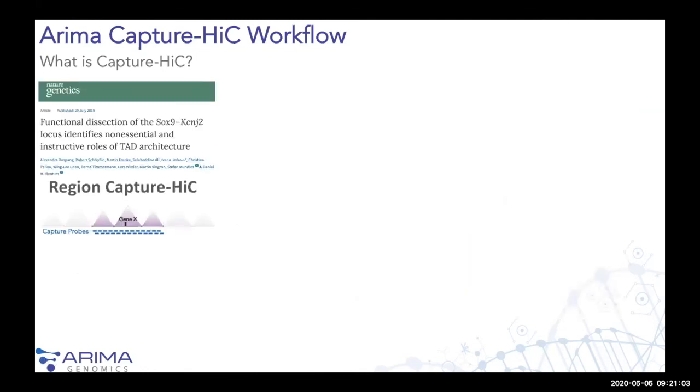So really, I think just to get you thinking about how this might be useful in your research, there's a couple different flavors, I would say, of Capture-HiC to think about. There's the concept of, let's say you have a gene or several genes of interest, and you're interested in obtaining Hi-C type of data around just those genes and not the whole genome. Then you might do an experiment like region Capture-HiC, where you design your capture probes to enrich for the contact domain that contains your gene of interest and maybe the flanking domains as well, but then leave everything else behind.